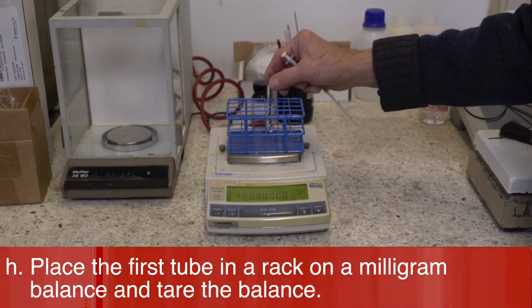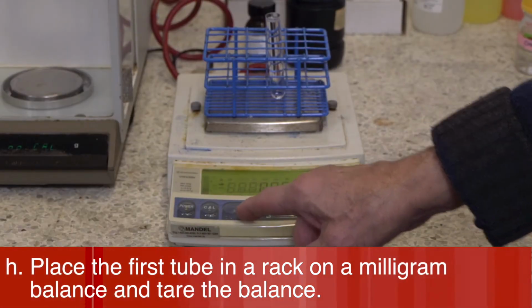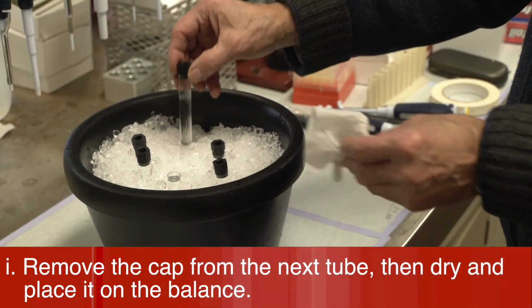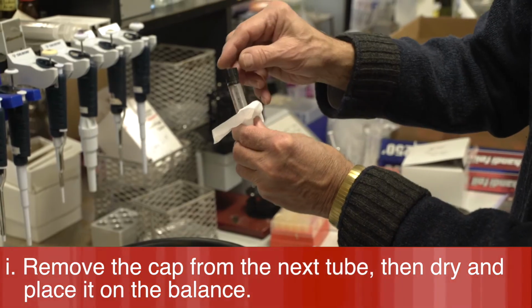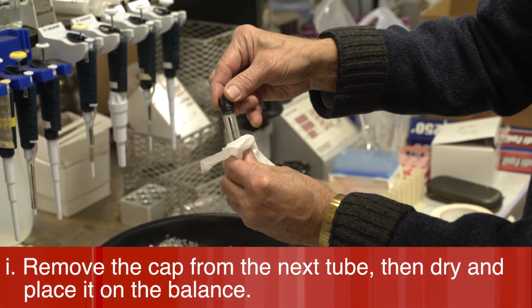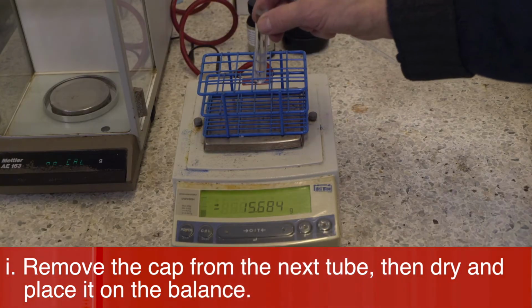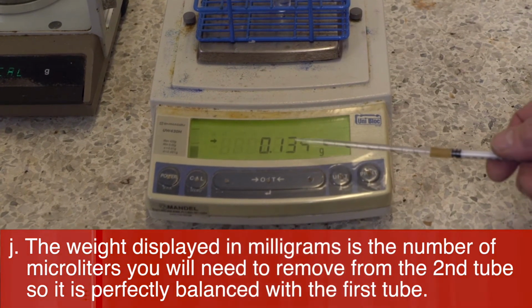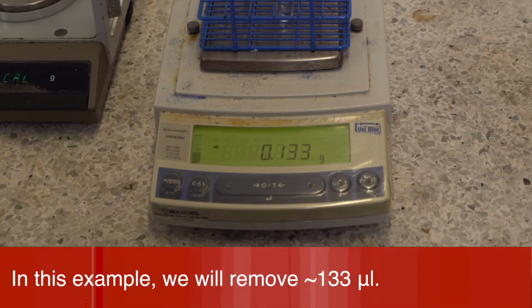Place the first tube in a rack on a milligram balance and tare the balance. Remove the cap from the next tube, then dry and place it on the balance. The weight displayed in milligrams is the number of microliters you will need to remove from the second tube so that it is perfectly balanced with the first tube. In this example, we will remove approximately 133 microliters.